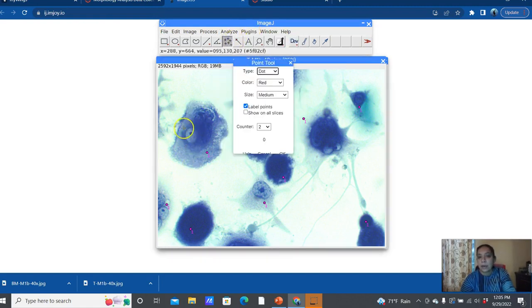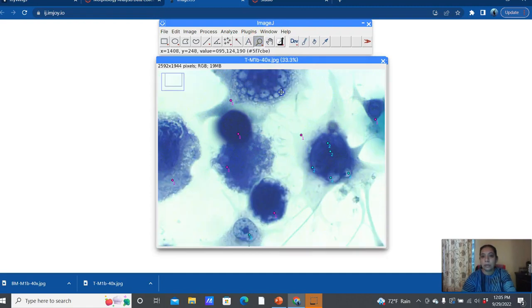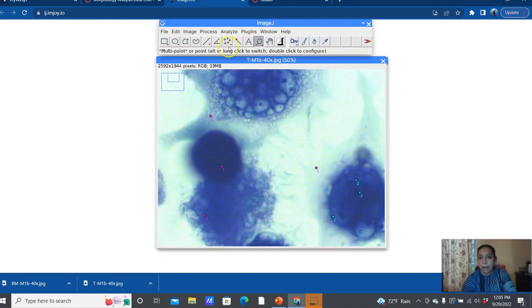Yes. And so here you have a nucleus. I'm going to count that. This one, I can't really visibly see a nucleus in here or in here. I do see one here. This one has a bunch of nuclei, right? So you're going to try to make the best judgment. You can expand them, right? You can use this tool to make it bigger so you can look at them better, right? And then you can continue to count your nuclei.